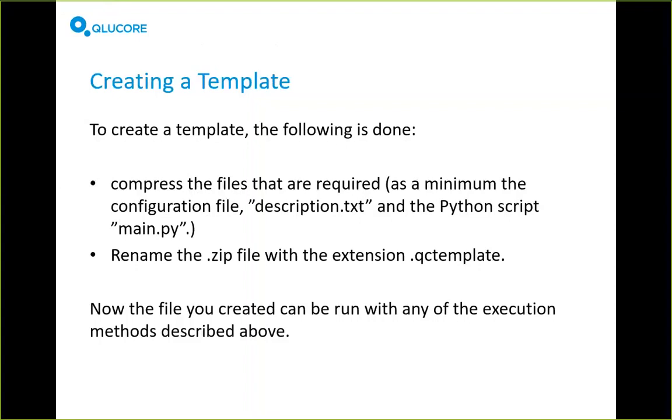And the templates that we ship with the program, they are, as you saw, rather well documented and commented, so they are quite easy to get started with. If you take one of those and modify it, that's basically the easiest way to get started with this. The description file also needs to be present, so the software knows what to do with the template and whether or not to show a user interface for it. And then you take the files and you just compress them and you rename them.